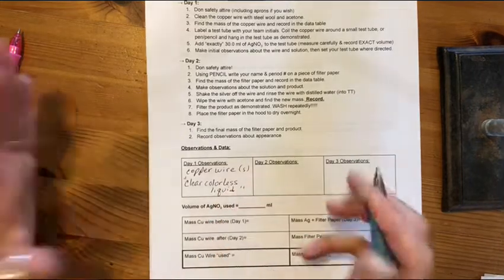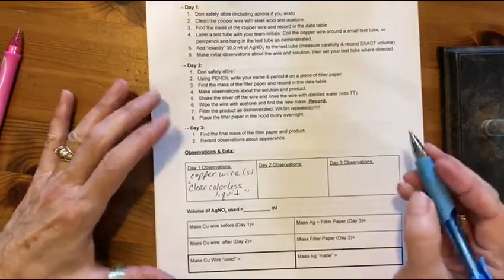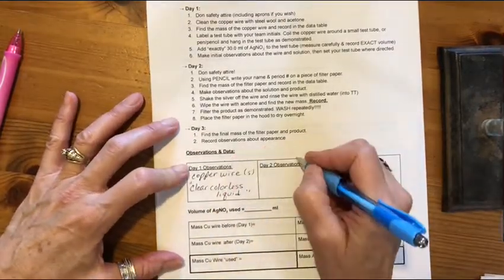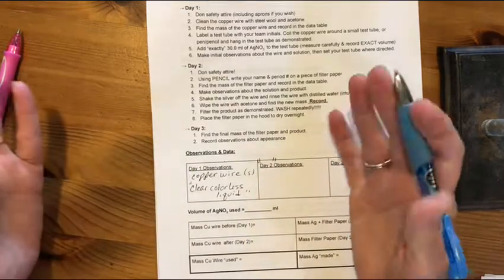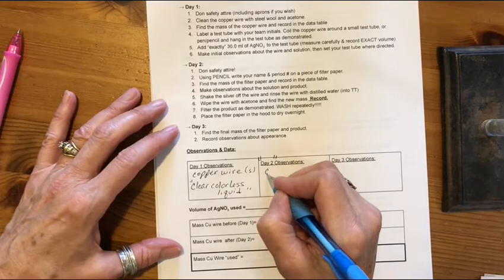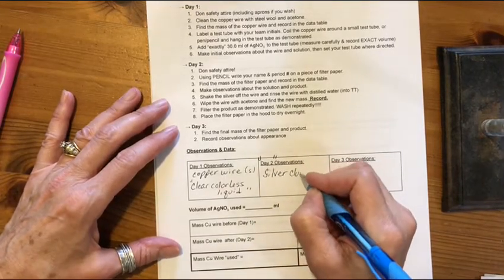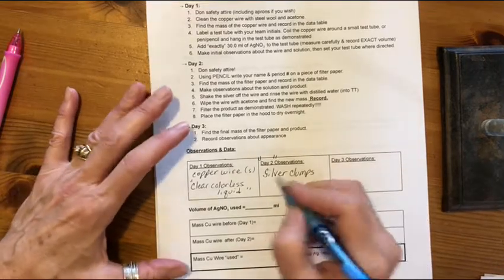Looked pretty much like water. There are actually a few black specks in the silver nitrate. Sometimes it does precipitate out. So this was at the beginning, the second day, quote unquote, after a couple hours have passed. You can see that there was silver dangling off the wire, silver clumps on the wire. It's really cool looking. I hope you watch the video.